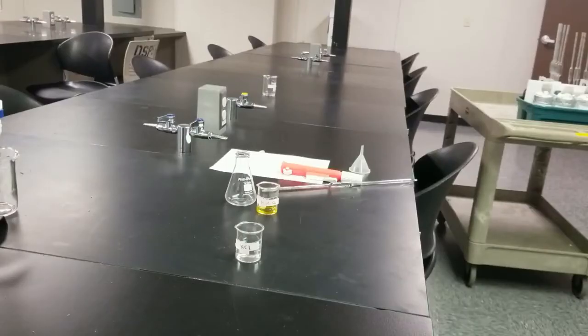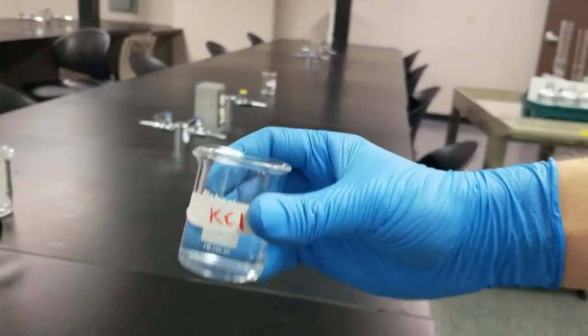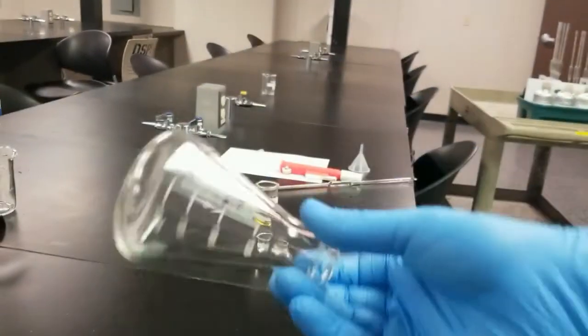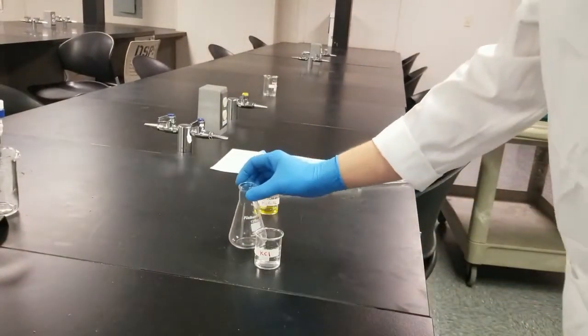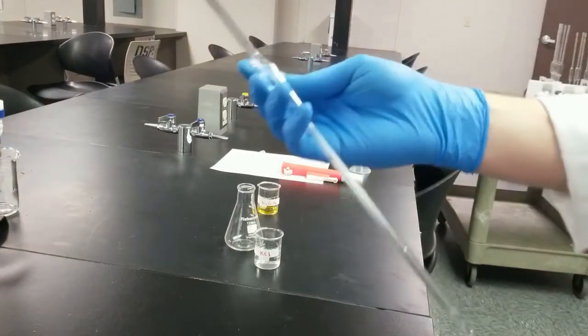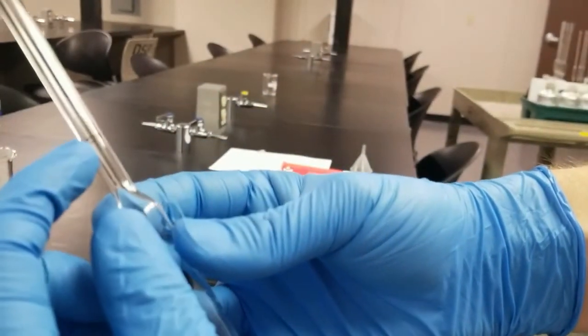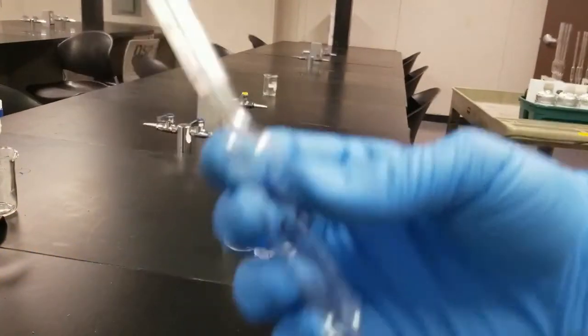All right, next up I have to make my solution to be titrated. So here I've got my potassium chloride, and I'm going to transfer exactly 10 mLs into this Erlenmeyer flask, right? So we want this to be volumetric. So we're going to use our volumetric pipette. You can see this one dispenses 10 ml, and that's where the bottom of your meniscus wants to be, right at the bottom of this line right there.